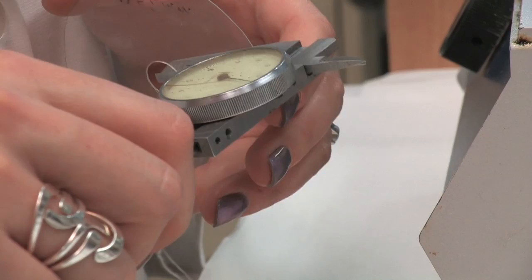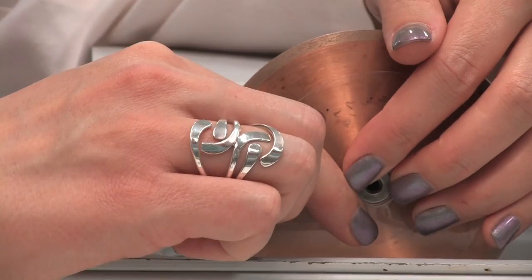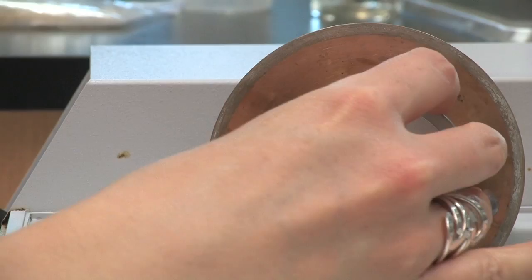For preparing otolith sections for age determination, we typically set the spacers to 0.6 mm. If you are preparing sections for bomb radiocarbon samples, set the spacer thickness to 1 mm. Once the blades and spacers are installed, add another blade keeper, then the small black cylinder and retaining nut, and tighten with a wrench.